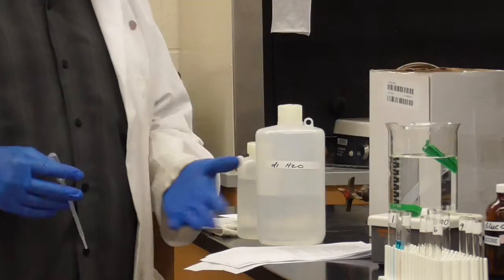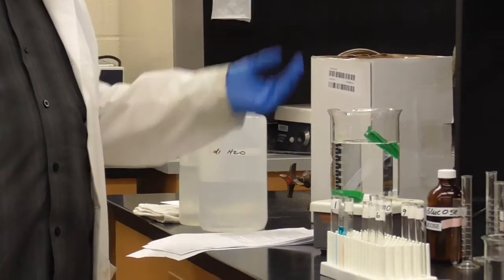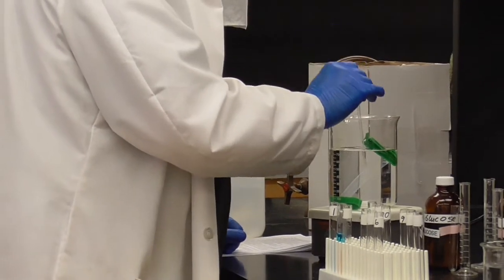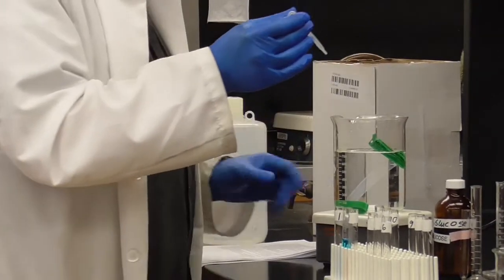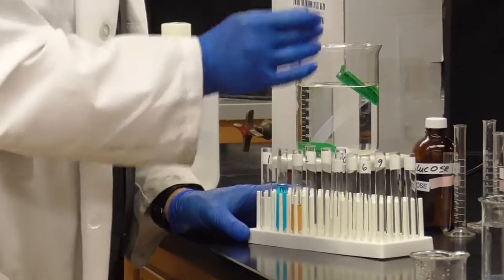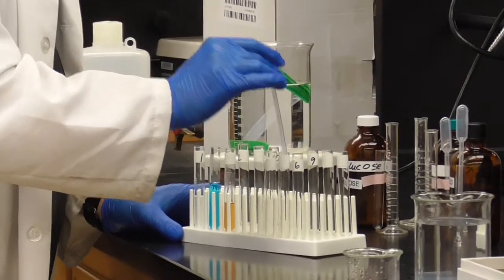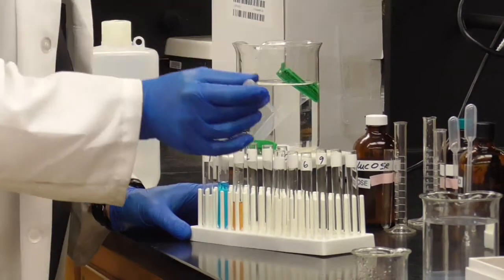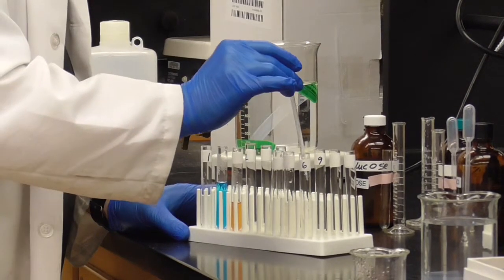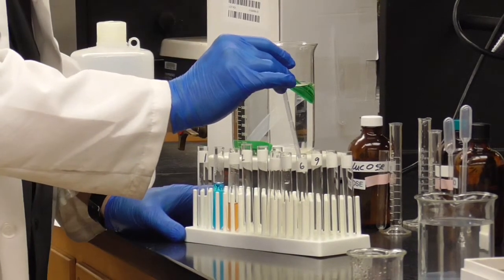Okay, so it's been 15 minutes. We've been dialyzing for that whole time. Now it's time to test that water on the outside of the bag again to see if anything has crossed over. So I'll go ahead and take a sample of that water into our second set of test tubes, about 3 milliliters each. Here's our first one. Yeah, 3 milliliters is about 2 squirts in this pipette. Just grabbing the water from the outside of that dialysis bag.